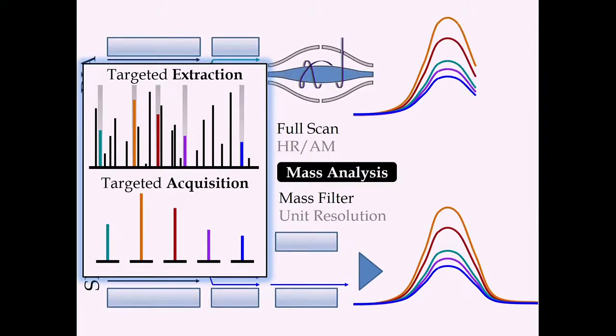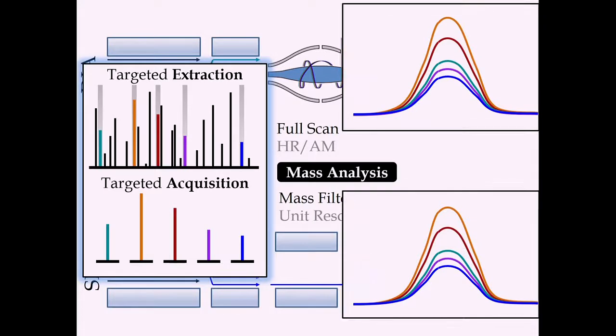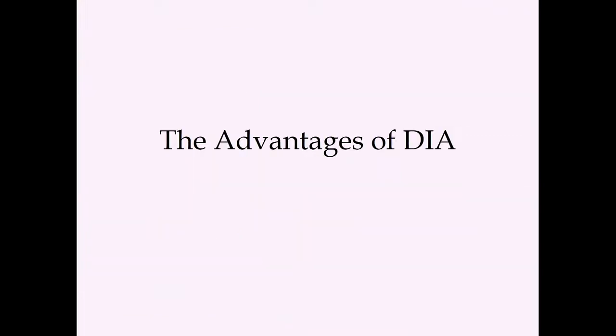But in the end, the data looks basically the same, and we use very similar tools to integrate and determine the quantities. Okay, so what are some of the advantages of data-independent acquisition? So this depends on who you're talking to.